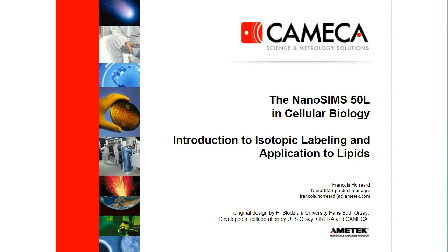Today we will start with basic isotopic notions, followed by some NanoSIMS applications in the field of lipid studies when coupled with an isotopic labeling strategy. Refer to our other webinars or support for instrumental aspects.